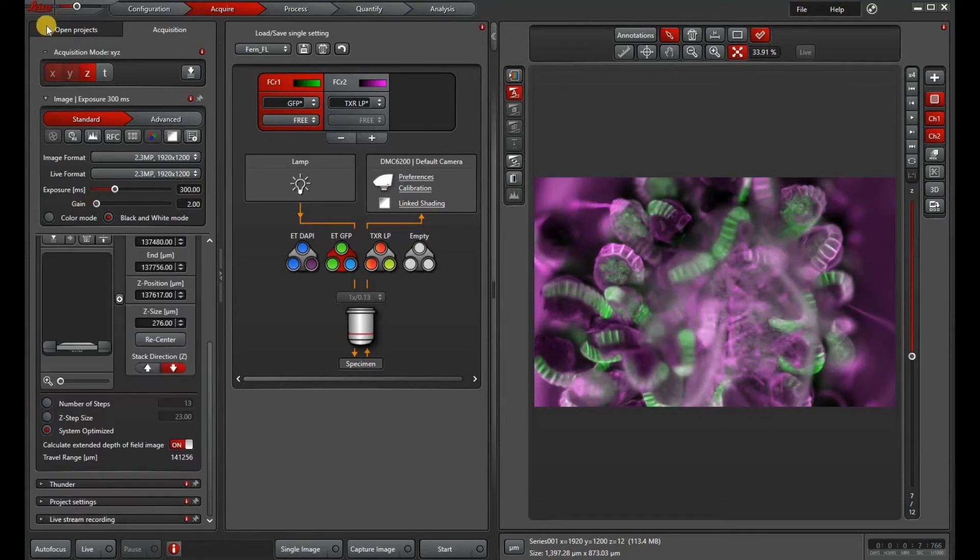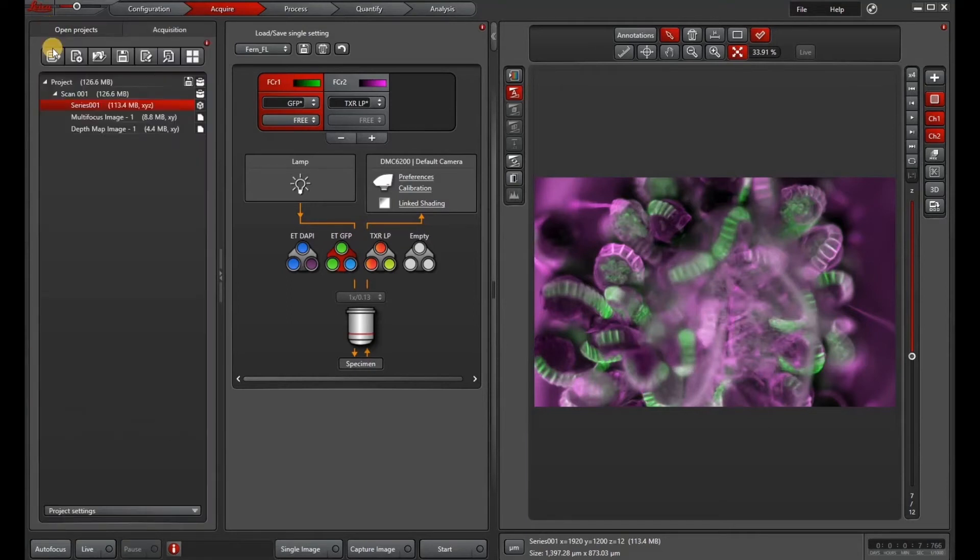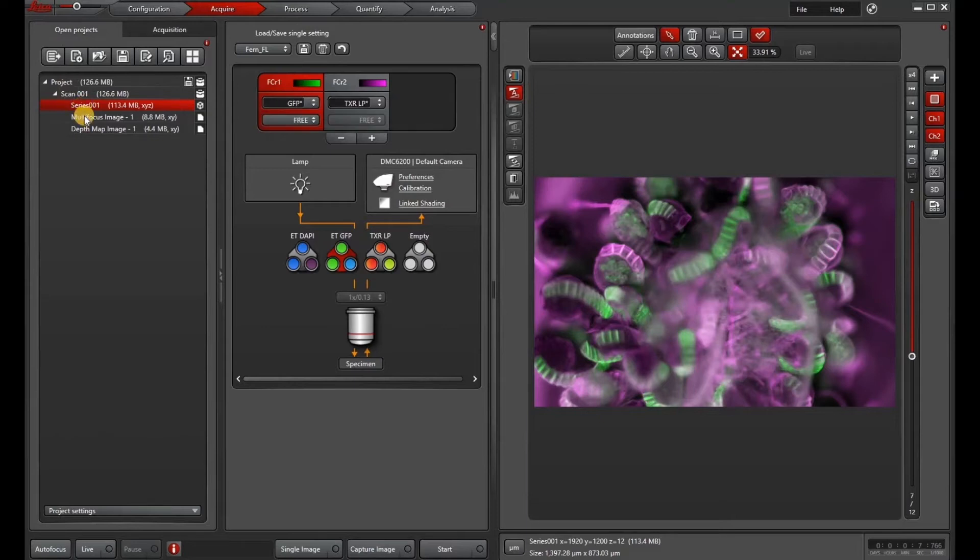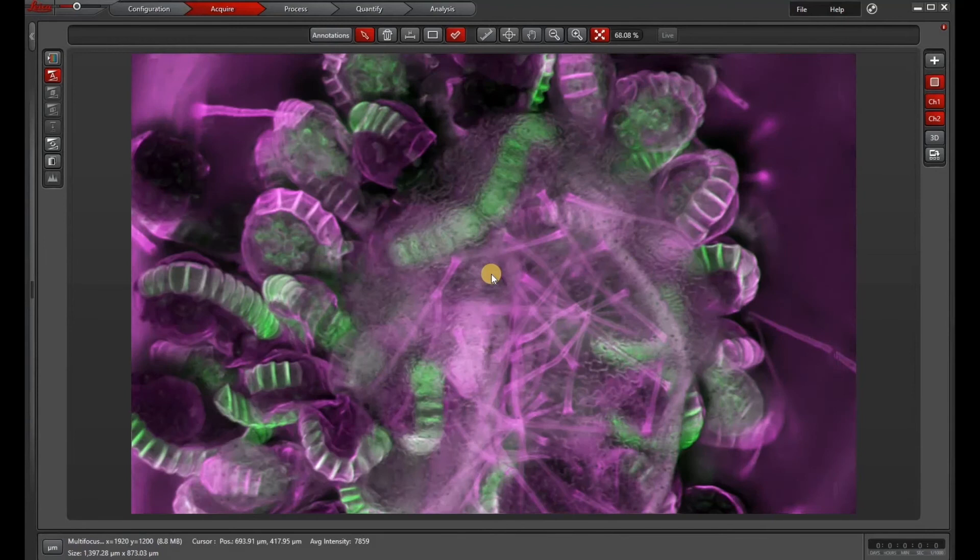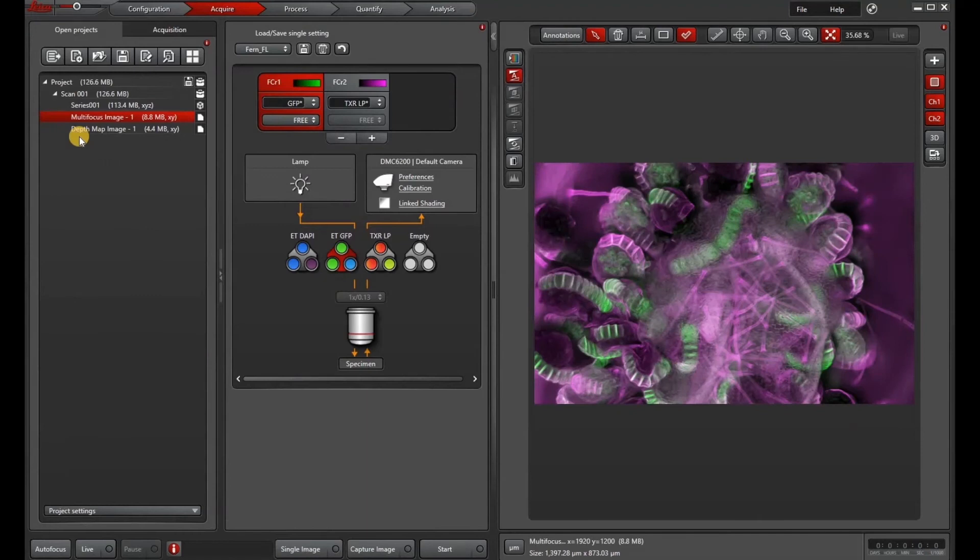Now let's go take a look at our extended depth of field or EDOF. So there's our series and then the multi-focus image is our extended depth of field. You can see that it does a pretty nice job of projecting a high contrast image of your z-stack.